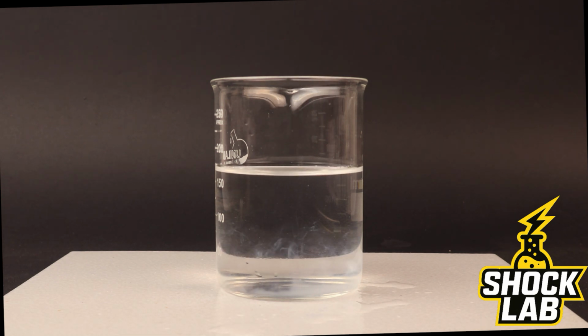Two simple steps, one fascinating transformation, and another reminder that chemistry can produce incredible changes with just a few drops.